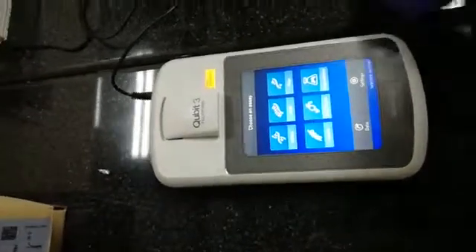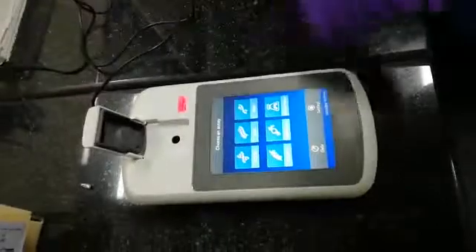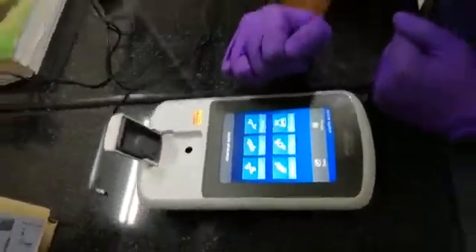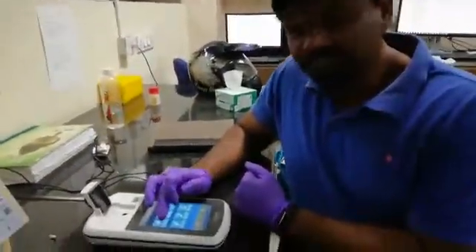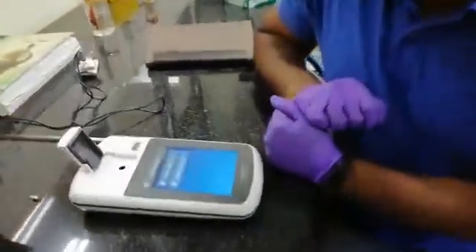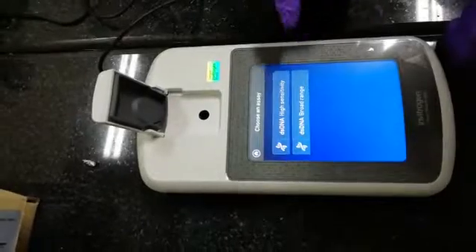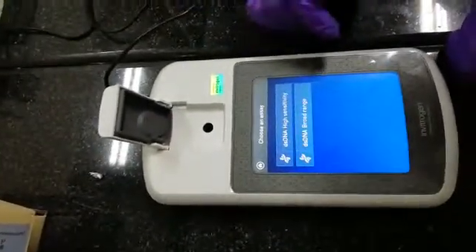It is very simple to use. You have to open the lid and see what you want to quantify. For example, now we are going to quantify the double-stranded DNA, so we press double-stranded DNA. There are two different types of kits: the double-strand high sensitivity kit and the double-stranded DNA broad range kit.